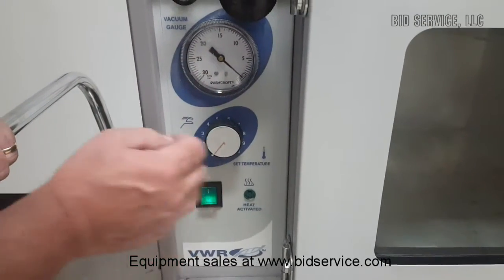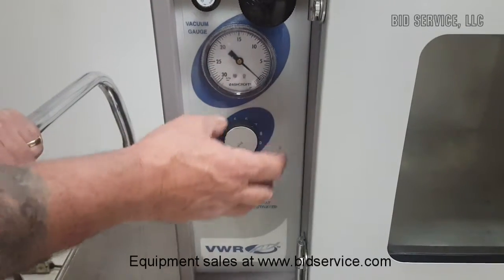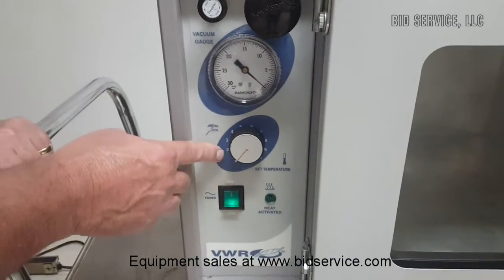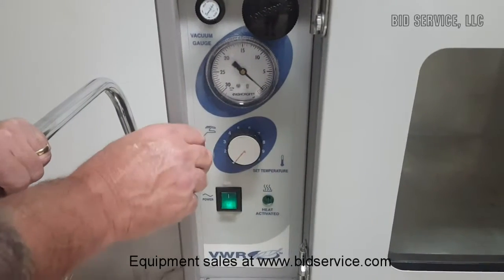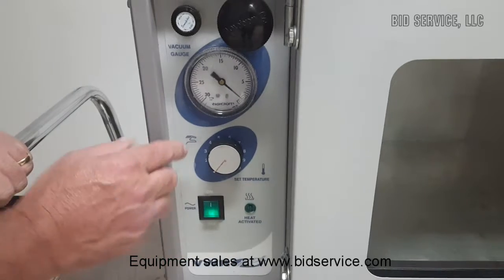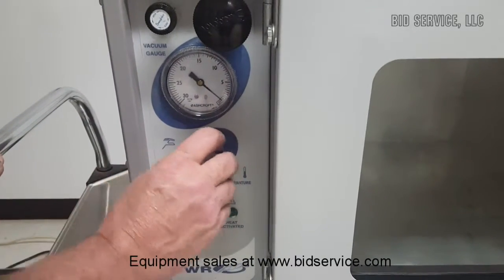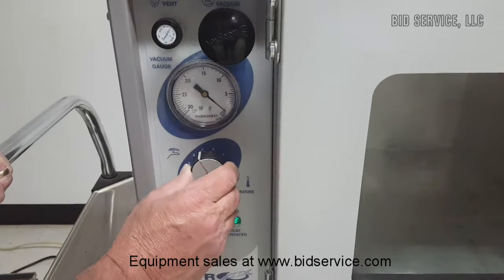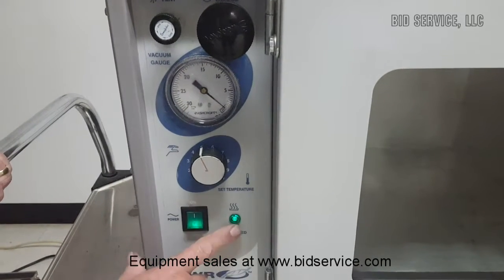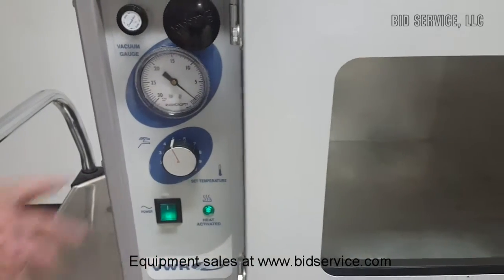The heat is adjustable through here. This dial is not labeled in degrees, so I've gone through each stage and I'll include a list of the temperatures I've gotten with my meter. You'll want to do this independently in your own lab, but a setting of five will give you approximately 100 degrees. I'm going to set it to five now — as you can see, the heat has come on.